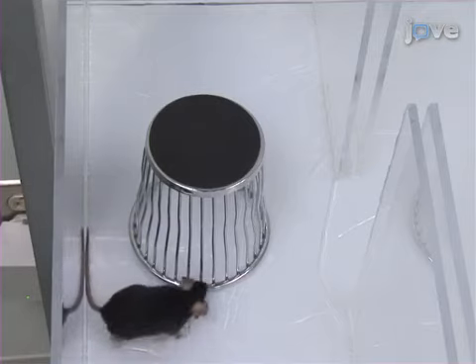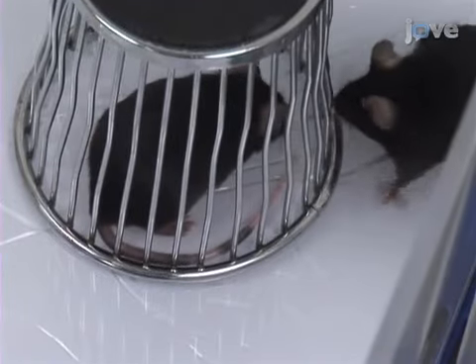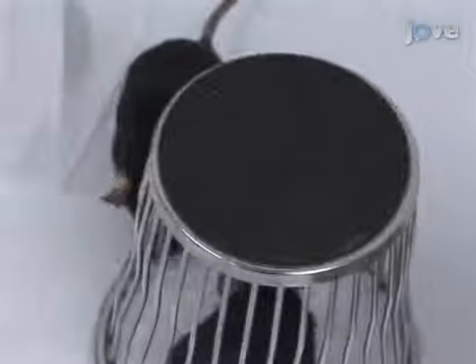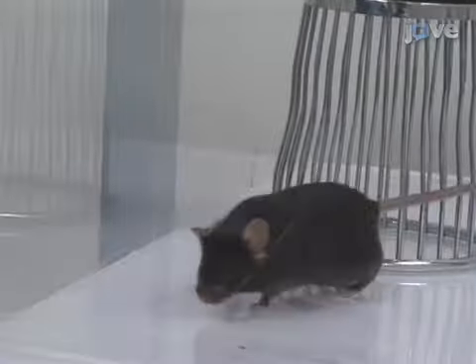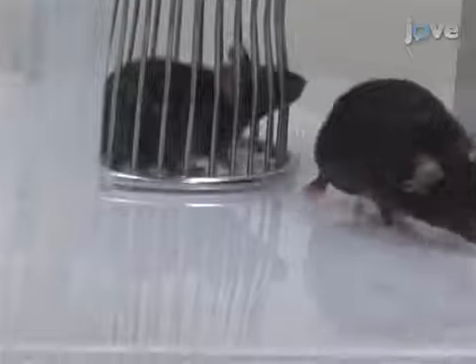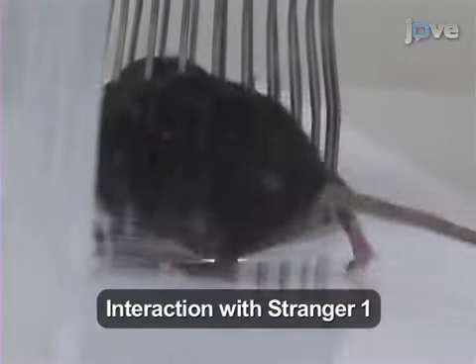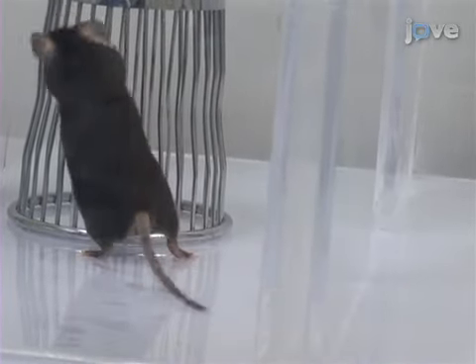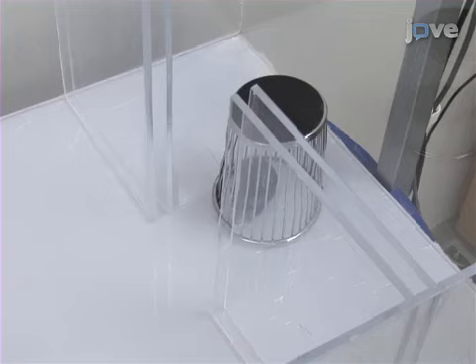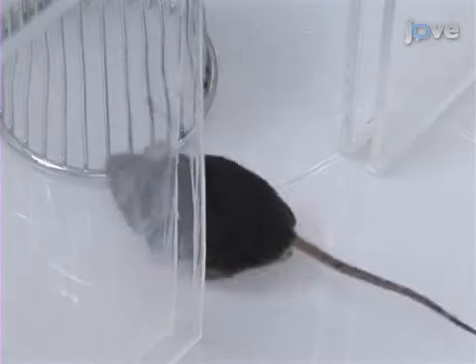An active contact is either a direct contact or a stretching of the subject's body in an area 3 to 5 centimeters around the cup. Also record the duration and number of other behaviors. These include walking, self-grooming, lack of any body movements for more than 5 seconds, or freezing, as well as any unusual behavior such as jumping, repetitive behavior, etc. The duration and number of entries into each compartment is also recorded. The mouse is considered to be in the chamber when its head and 4 paws have entered.